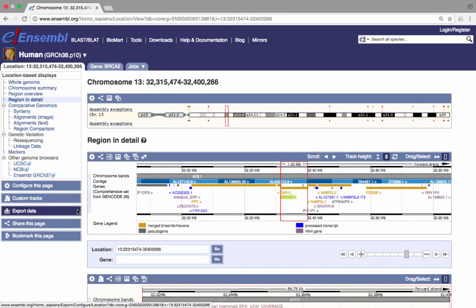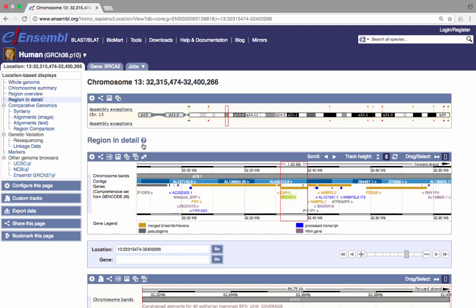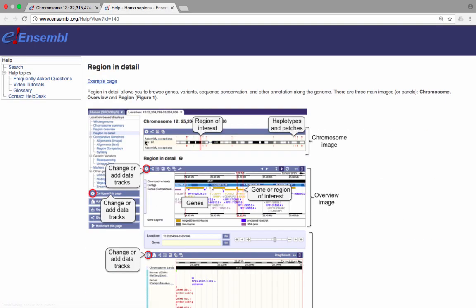Help is available on most Ensembl pages. You can access page-specific help by clicking on the Help icon for more information. In the Help window, we find a link to the documentation. There are also links to FAQs, the video tutorials and the glossary.